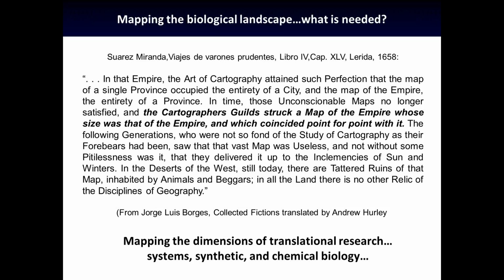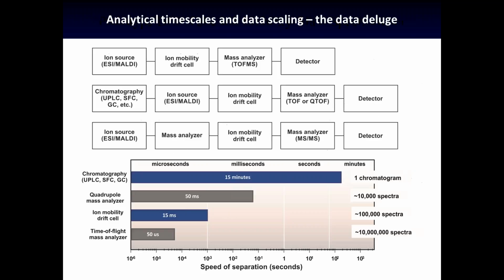And so what we're trying to do is find as many features as we can in the data sets, but then we need to use the informatics to rapidly funnel down to what were the interesting species, and then subsequently do the identification once we know what those are, rather than doing all of the identification at the first step when we have the very large data sets. And that is partly motivated as well by where we are in scientific history. And I would say that we live in a period where we have an unprecedented capacity to generate data.